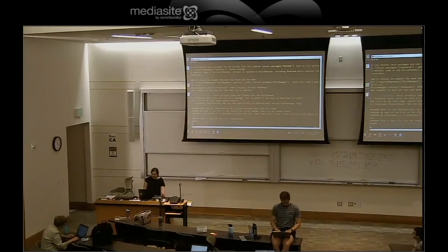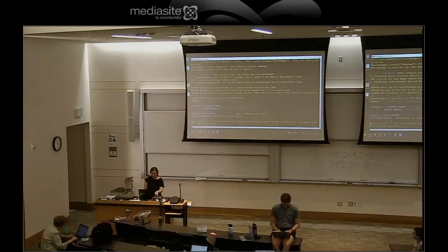Then you have to point to a lot of files, which you guys are used to from last week. Here is where, at the BAM directory, this is where all your BAMs are located. Then you actually put in all the names of your BAM files. Here's just 2, but you guys had 6. And your output for your actual counts.